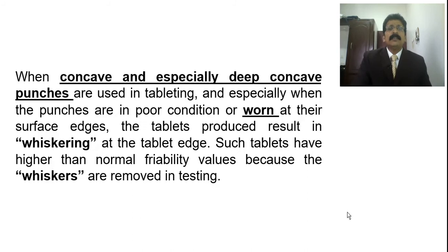So next slide. Now our question is, okay, we have checked the friability test using this Roche friabilator, but why is this friability taking place, and how can we control it? The pharmacist should know the defects and complaints, as well as how to solve them. Once you know how it happens to the tablet, then you can go for its solution also.